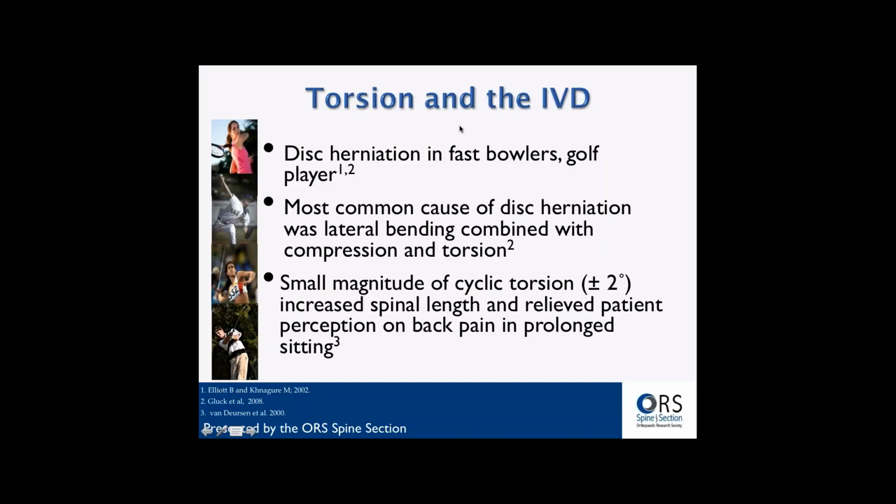So this is why we are actually building these bioreactors. Why should you come up with a design of a bioreactor? Because we haven't found anything we could take off the shelf which was able to do a 2 degree of freedom motion. And for disc herniation, there's a lot of knowledge around that there is an increased risk for disc herniation.